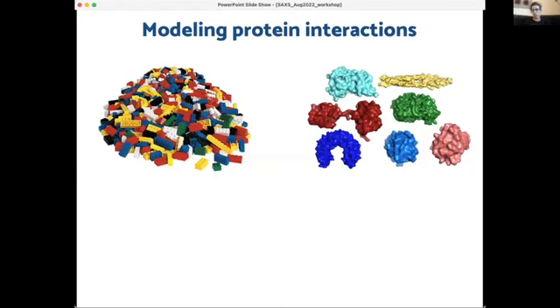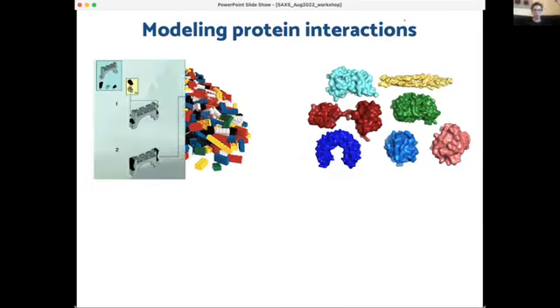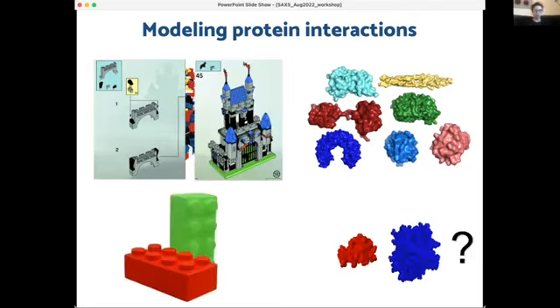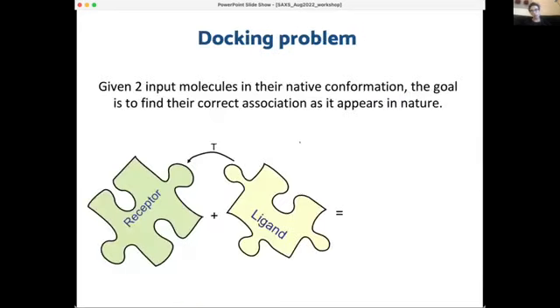Okay, so now I'm going to complexes. And we can model protein-protein complexes using SAXS data. It's harder than Legos because there are no instructions. So we are going to use the SAXS as an instruction to help us.